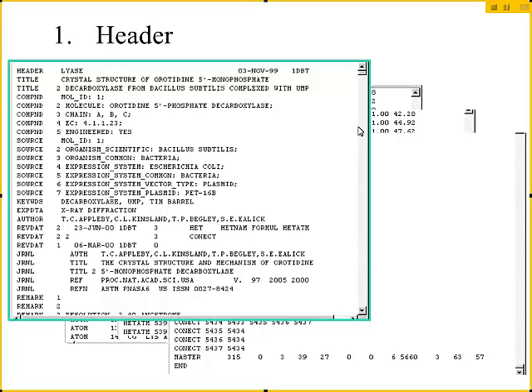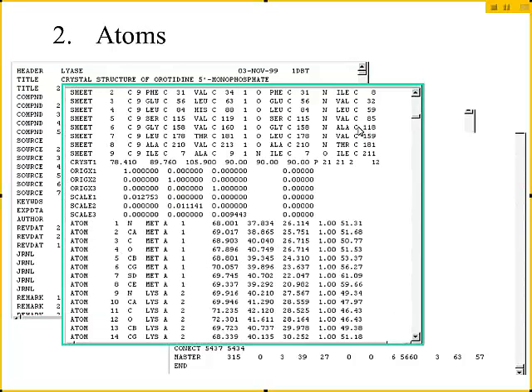At the top of the file is the header information. And so if you just do a search, you can search for biological, if you want to pull up biological unit, and it will tell you there. So the top of the file is the header. Down later on, you will see some atom lines. Now, there's a lot of information in the header. And if you want to look at a file, you can display the file on the website. And if you scroll on down, you'll see atoms.